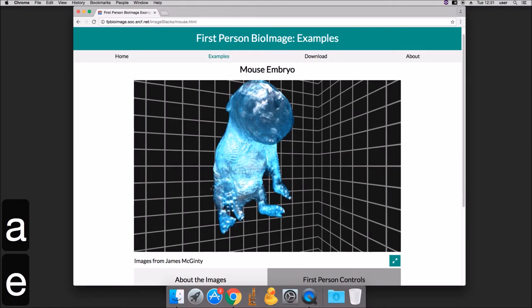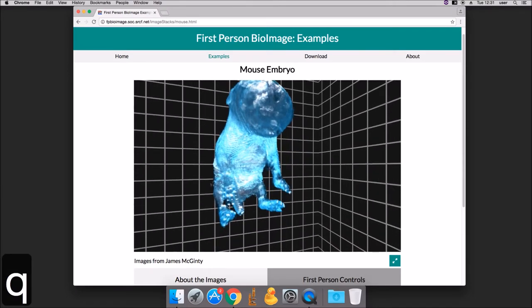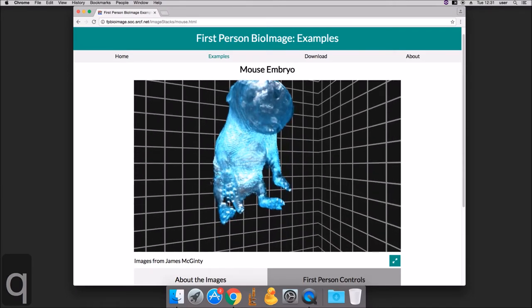You can also move the camera up and down using E and Q.